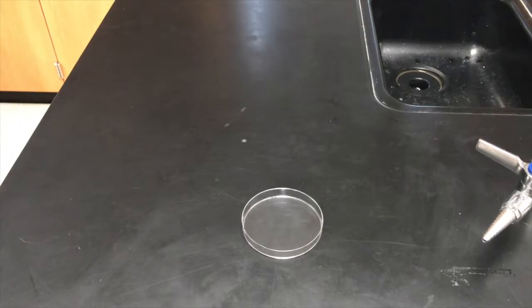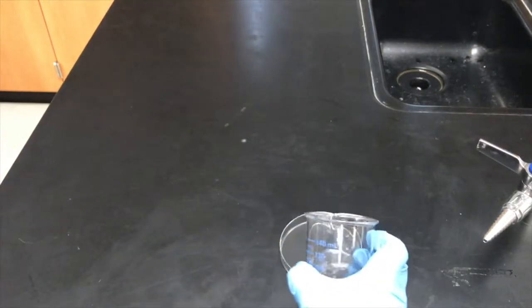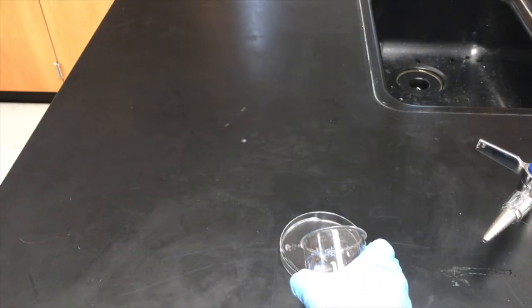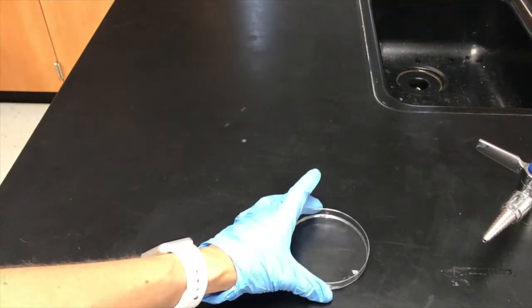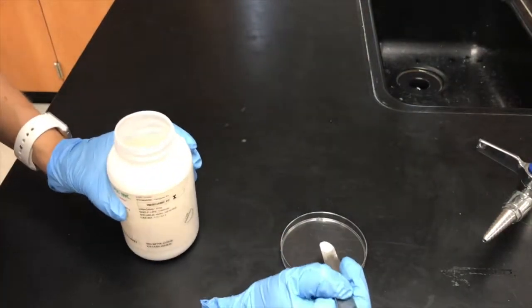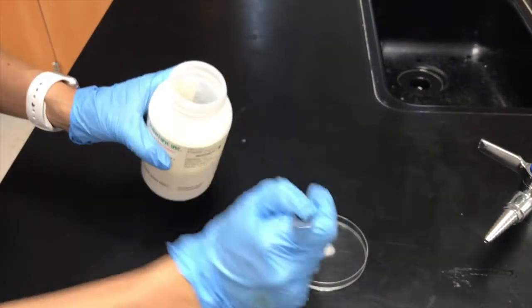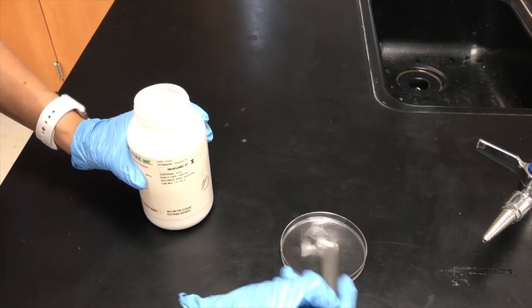So in this video, I'm going to show you the first example of an electrolysis reaction. The first thing I'm going to do is take my Petri dish and pour some distilled water in it. Make sure it's totally full. And then I'm going to add just a little bit of sodium sulfate into it. Keep in mind, as I had already reviewed, your potential reactants are going to be water, sodium ions, and sulfate ions.